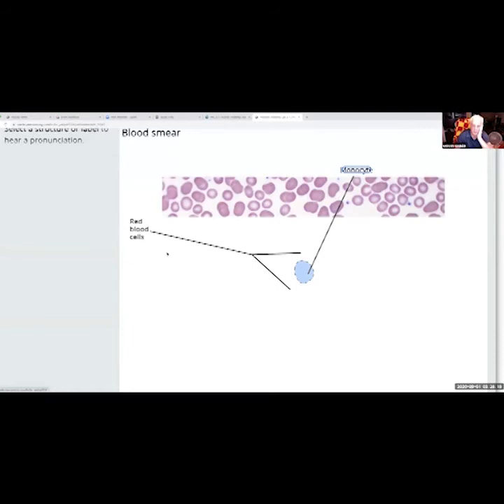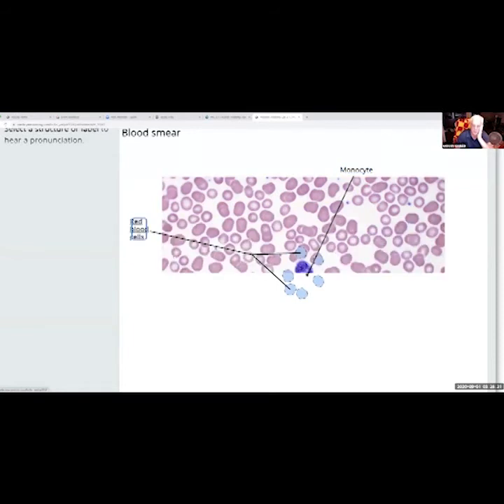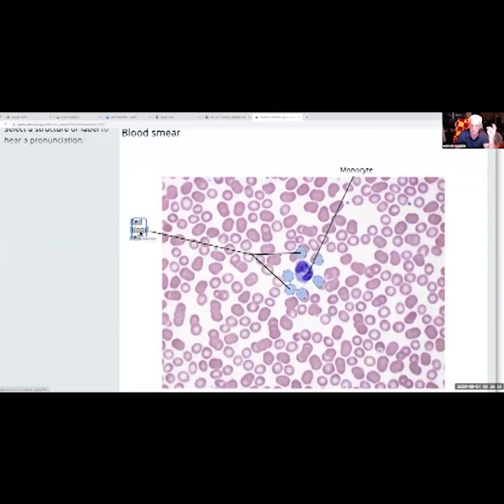Okay, again, red blood cells and a white blood cell, which is going to have to be a monocyte. A monocyte is a phagocytic white blood cell that eats other cells. But again, you can see the red blood cells. Just as you pointed out, it's real important to notice some red blood cells are dark red, some have white areas in the center of them. It all depends when you squish that cell. You have to remember, it's a biconcave disc. In the center of the disc, it comes in real narrow. So if you're looking at it this way, you're going to see white. If you're looking at it this way, you see all red. You're taking a three-dimensional object, squishing it and putting it in a two-dimensional field. That's a really good question.